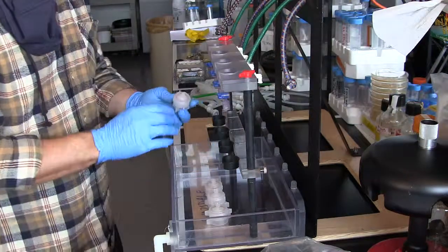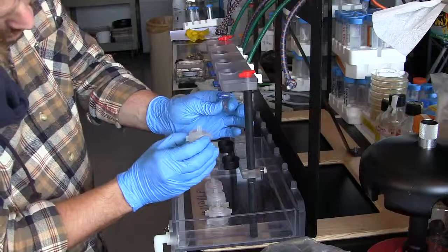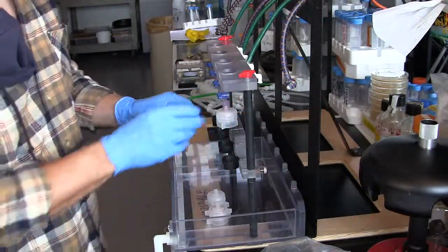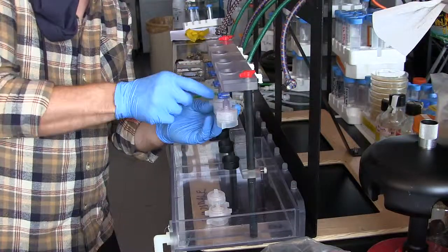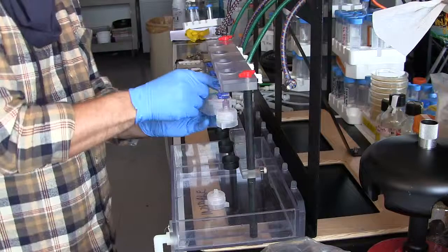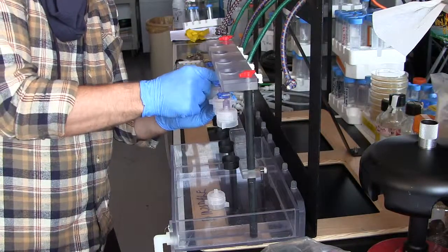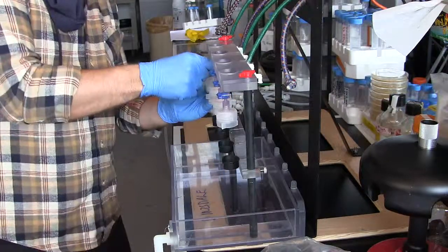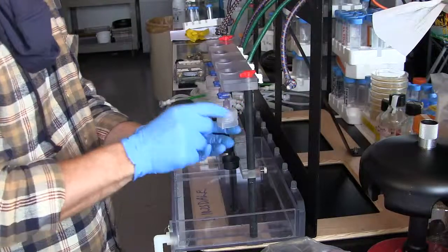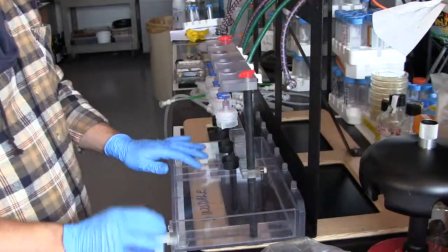Okay, so what you do is you just take each of these filters, holding this ring that moves here, just screw them in like that. Alternatively, if that's not your style, you can hold this in position and use that moving ring just to tighten it down. Depends on how you want to do it. Right now I'm going to do it quickly, or theoretically quickly, that way. Alright, make sure they're all nice and tight. Okay, sweet. So now we have the water flow end set up.